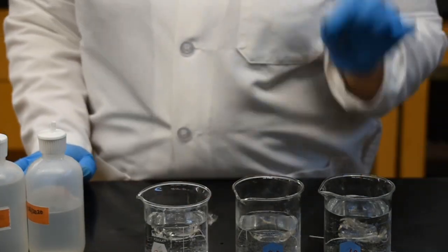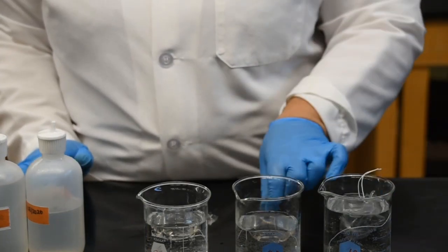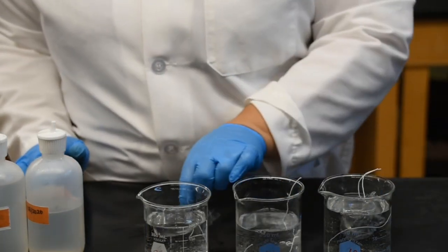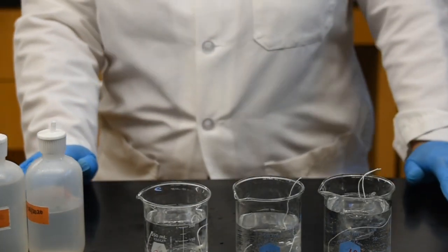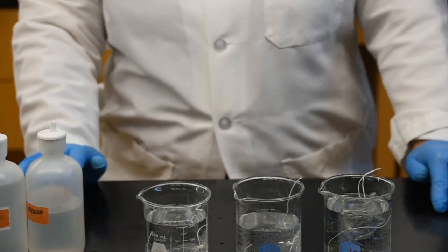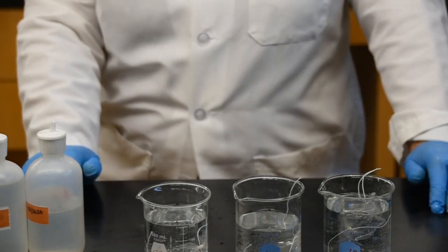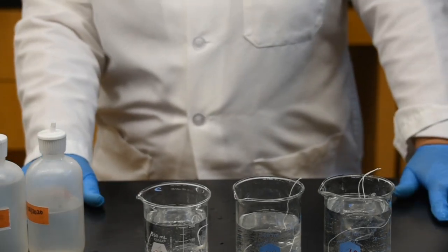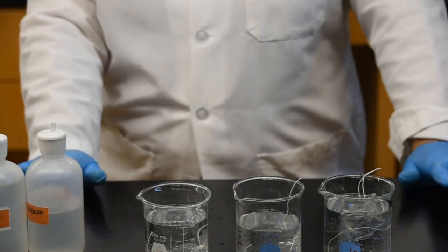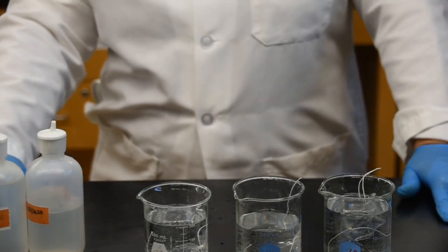So again, I'm going to, simultaneously, introduce these baggies into the water and start a timer that will run for 45 minutes. I'm going to weigh these baggies again, and I'm going to see which of these baggies have gained the least weight versus the most weight. Based on that, I can answer my prediction of how the percentage of sugar affects my osmotic pressure.